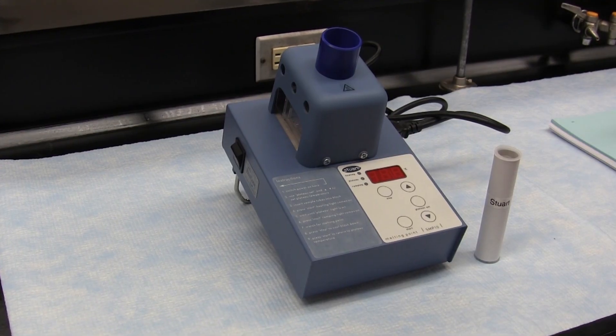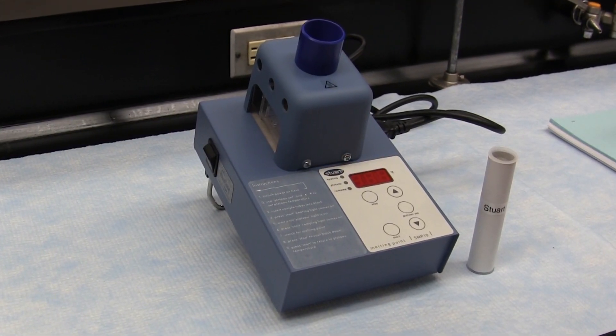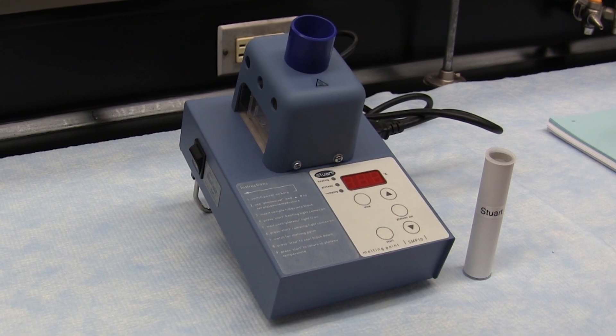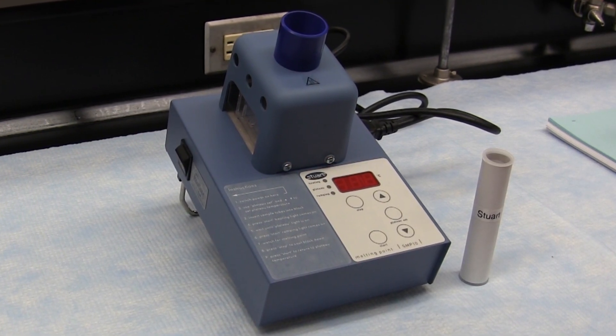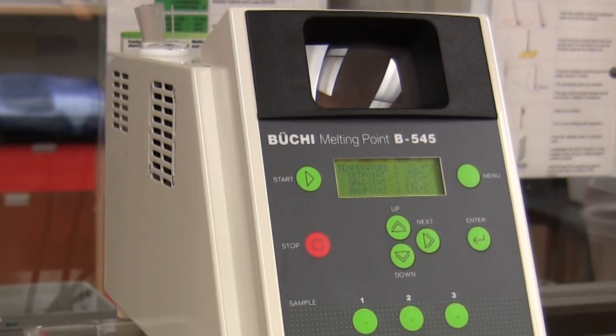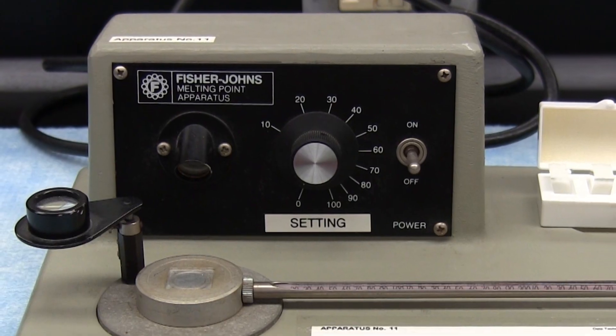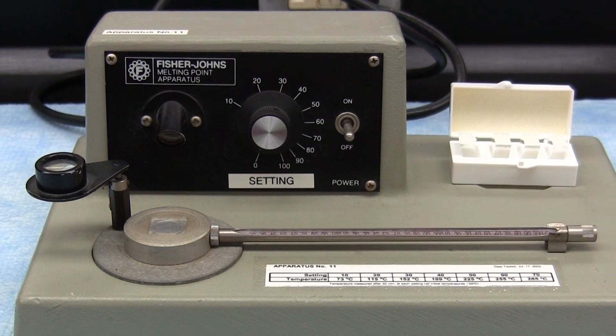Your lab has recently been equipped with a number of Stuart SMP10 Digital Melting Point Apparatus. This apparatus is in addition to the other two types of melting point apparatus available: the Büchi Automatic Melting Point Apparatus and the Fisher-Johns Melting Point Apparatus, which the Stuart Apparatus will likely replace in the future.